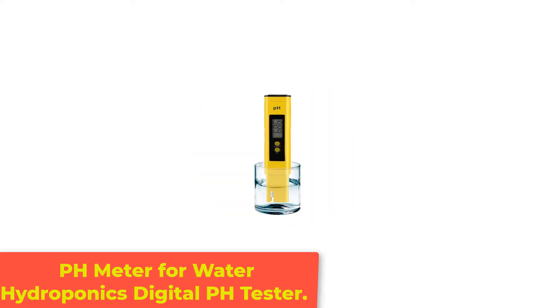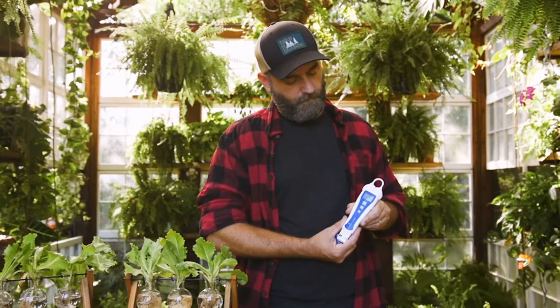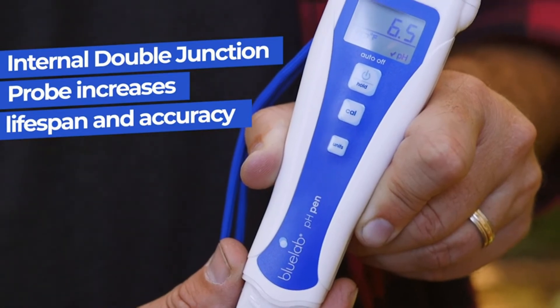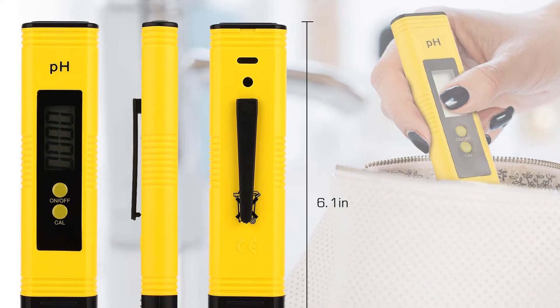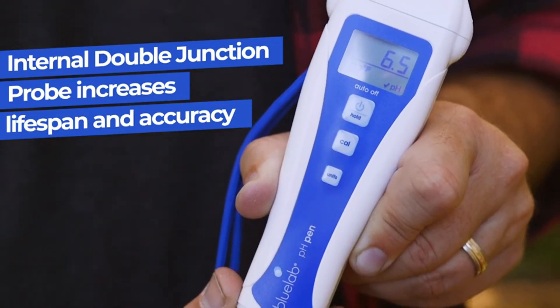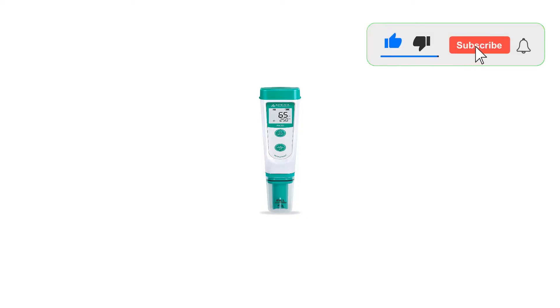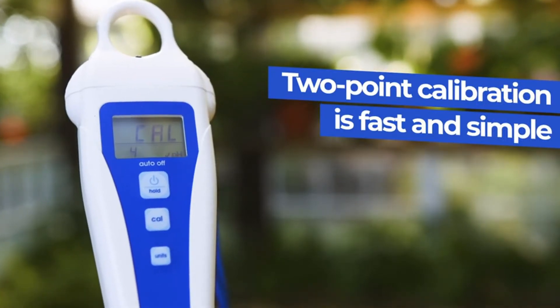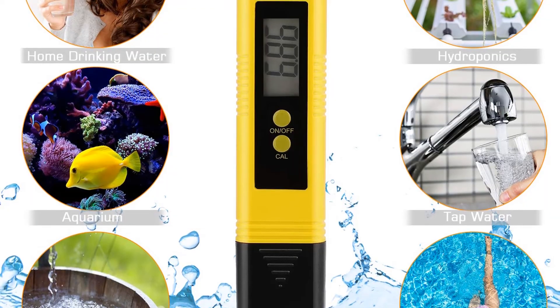Number 4: pH Meter for Water Hydroponics Digital pH Tester. The first on the list is the digital pH meter. This first contender has some very good qualities, making it a great option for first-time buyers. It functions as both a thermometer and a pH meter for the water. It's easily calibrated with a single touch and doesn't take a long time. It provides instant pH readings for both temperature and water quality. This pH meter also comes with an amazing low price, making it a great option for someone who wants to save money. But you may be in the market for a replacement within a few months. It works in a pinch, though, with quick readings and relatively good accuracy.